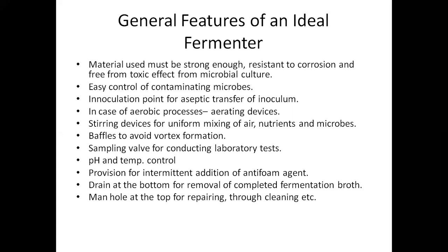There has to be a control of pH and temperature system in the fermenter, and also there should be a provision for intermittent addition of antifoam agent. There should be a drain at the bottom for removal of completed fermentation broth, and there should be a manhole at the top for repairing, thorough cleaning and other such activities.